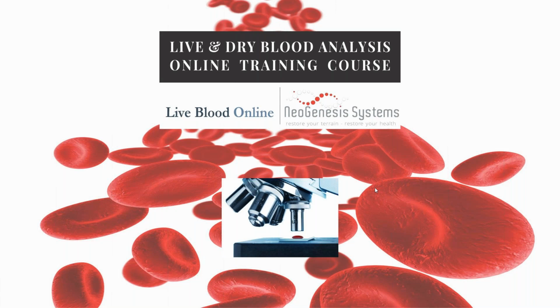That's the final requirement for certification. So the practitioner would have to have a microscope to be able to submit their case studies. But we do provide enough time for practitioners to submit their case studies after completion of the course, when they eventually get set up with a microscope.